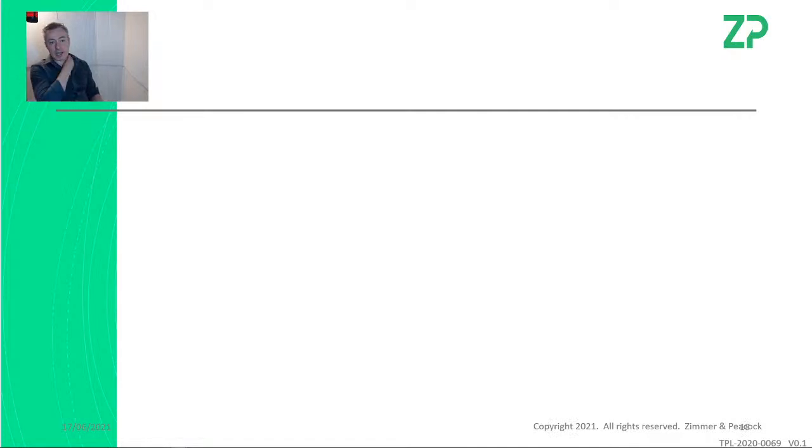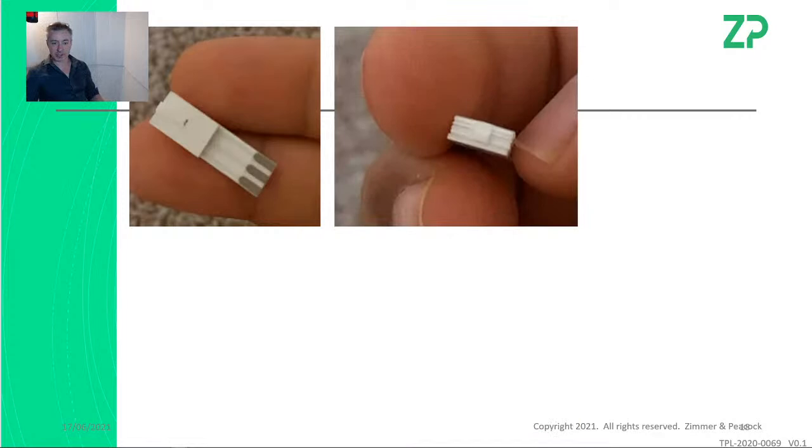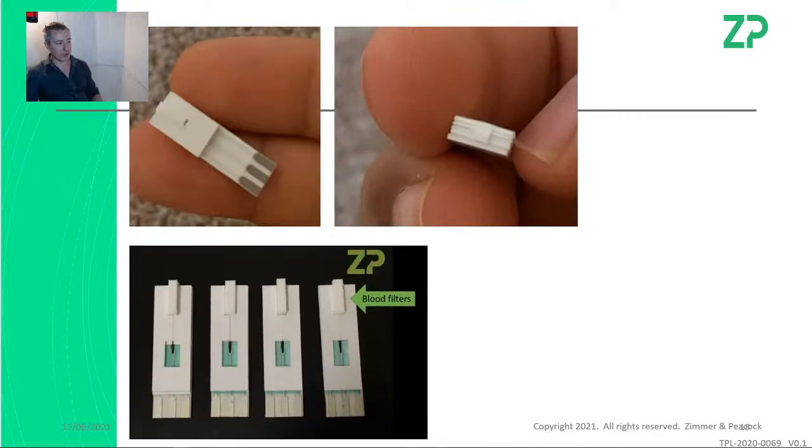This is also a Collaborator Support. So a Collaborator's received some of these electrodes. Again, it's great. You know, they sent photographs in. I can clearly see what they're asking. So really appreciate that. What they're referring to is these electrodes. They've got like a new generation, but the original generation is up on the website, where they've got essentially, we call them capillary fill electrodes with filter in place. So they have a capillary fill electrode with filter in place.